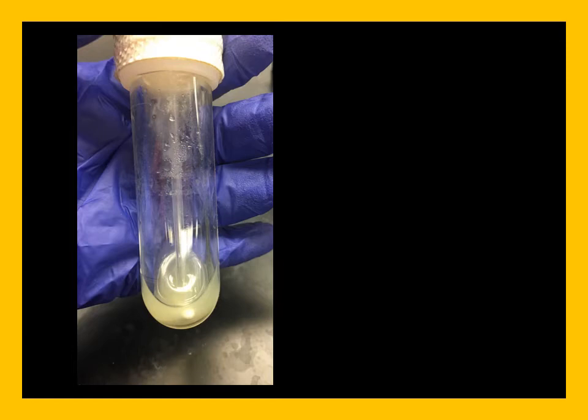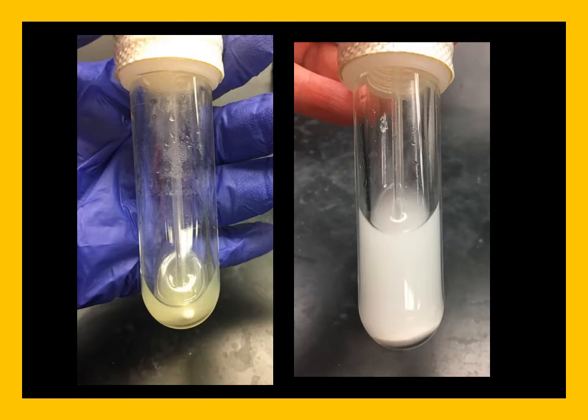But if we compare this to our reaction at the beginning, we see that there is substantially less volume. That means that some of my solvent or perhaps some of my product has evaporated out of the tube. And so we need to take this into account when we're thinking about the reasons for lost yield, is that there was a substantial amount of evaporation out of the tube.